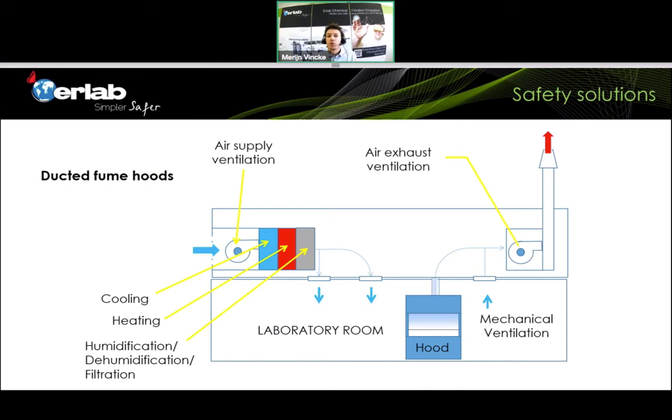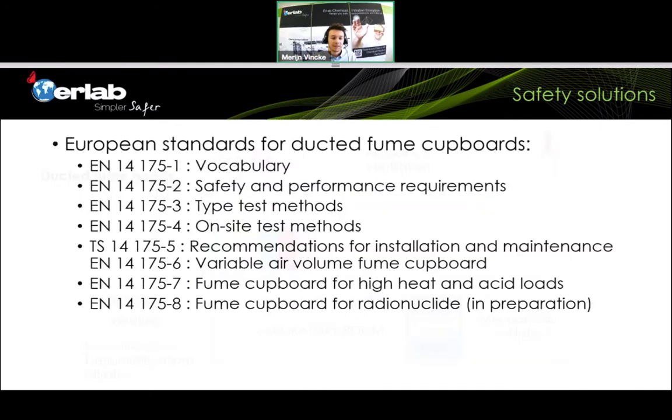So a ducted fume hood is a good solution. It will keep you safe. It's an important safety equipment that can be used. But it depends again on the risk that you're exposed to, and then you need to know what to use. But on the next slide, that will maybe appear for some of you in a few seconds, you will see some European standards about ducted fume hoods.